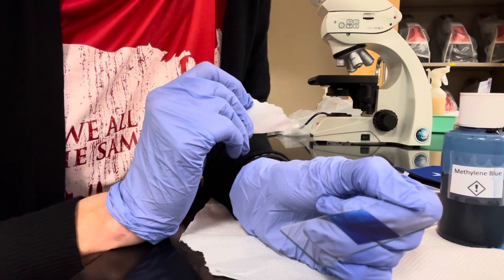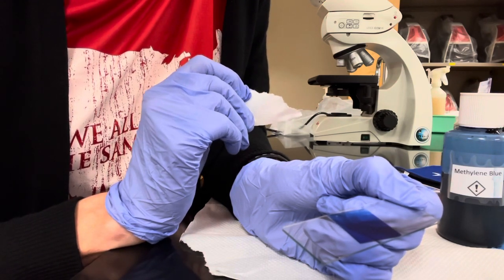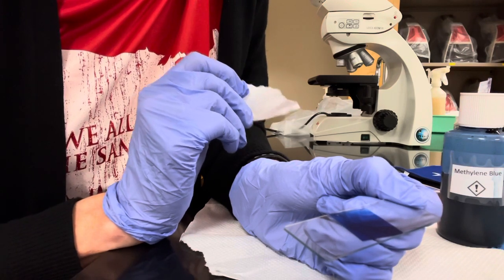Go ahead and use all the way up to oil. And what I want you to do is to estimate the size of those eukaryotic cells.